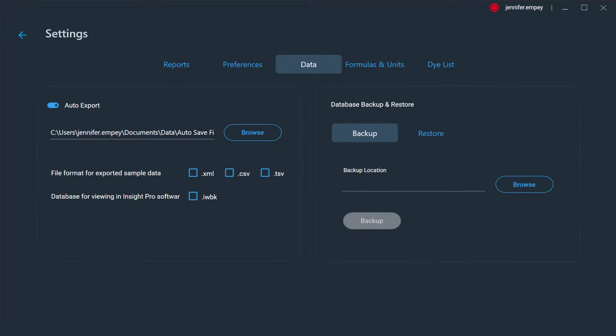A backup location for the database can be selected, as well as a secondary automatic export path. The file types of the saved data include .xml, .tsv, .csv, and .iwbk. The latter file type is unique to the Insight Pro software.